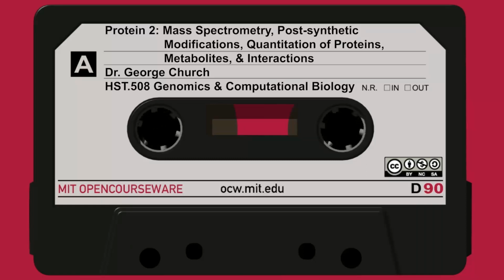Okay, so let's return to mass, and this time in the context of mass spectrometry. What's our starting point? Well, if you look on the far left side of slide 11, you'll see the simplest of the atoms, hydrogen, and you would expect this to have an atomic mass of 1. Well, since carbon-12 is assumed to be precisely 12, it turns out that hydrogen is not precisely 1 when you actually measure it. And it's not even good enough for government standards. When you actually say add a CH2, it adds up to 14, and that is discriminatable from a nitrogen 14 with a good enough mass spectrometer. As it turns out, for most biochemical protein analyses, you don't depend on the 6th decimal point.